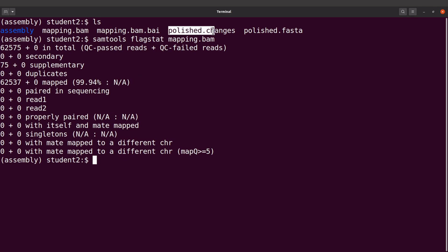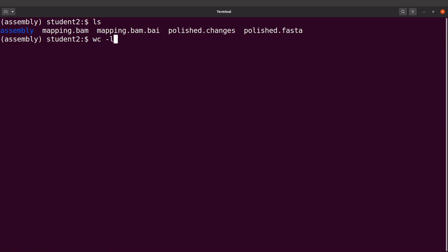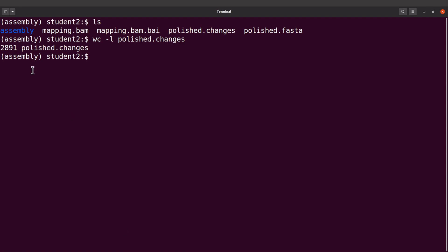Let's also look at the polished.changes file. This file has all the changes that Pilon made. We can look at the contents — let's do a head and specify the file. We are going to find the information: you have the changes that were made as well as the context in which these changes were made. You can also count the total number of changes that were made. So let's say: wc -l polished.changes. This will give you the number of changes. We have 2,891 changes.